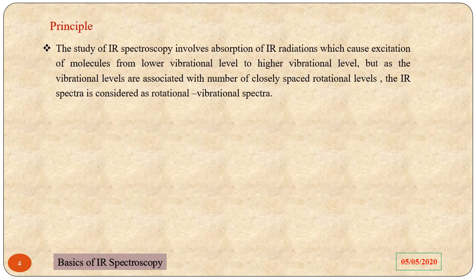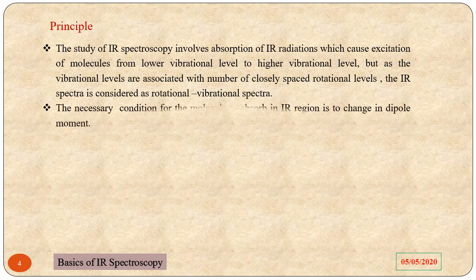The study of IR spectroscopy involves absorption of IR radiations, which cause excitation of the molecules from a lower vibrational level to a higher vibrational level. But as the vibrational levels are associated with a number of closely spaced rotational levels, the IR spectra is considered as rotational-vibrational spectra.